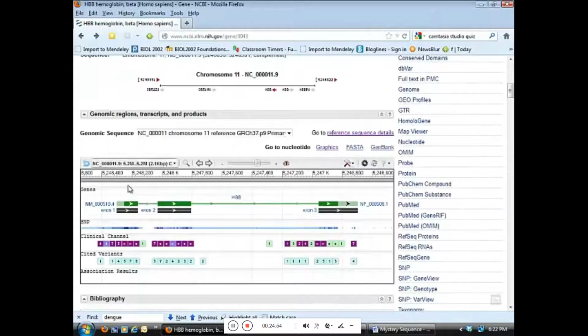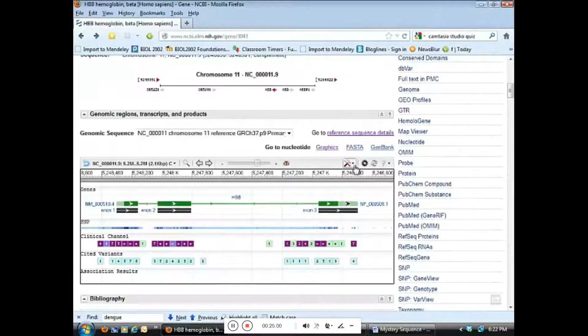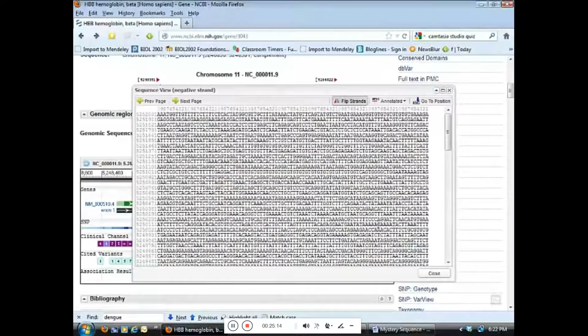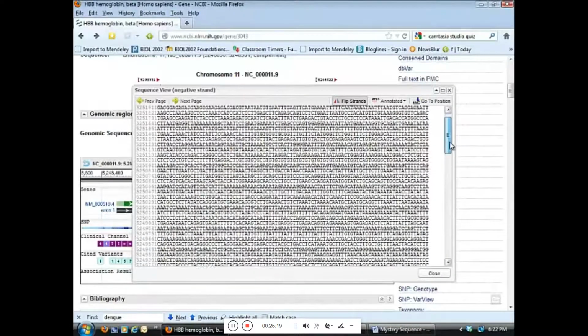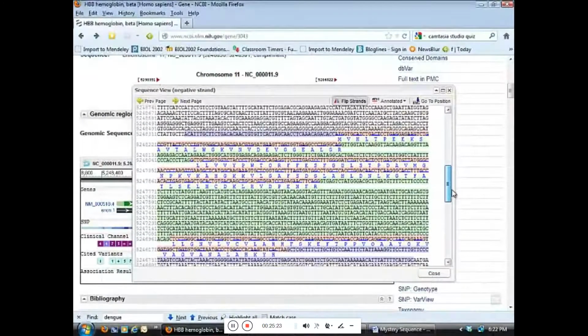And this is actually a very similar diagram. It just doesn't have that whole chromosome region that the last one did. Go to the Tools section, and in here go to this section where it says Sequence to Text View. This is very important. Don't forget this particular step because it's actually a great way to visualize things, in my opinion. And at first it looks like we have just plain sequence, but if we scroll down, you can see there actually are colors associated with the sequence.